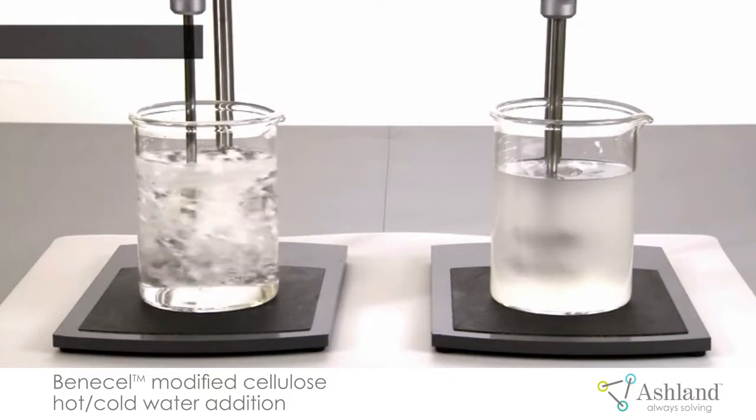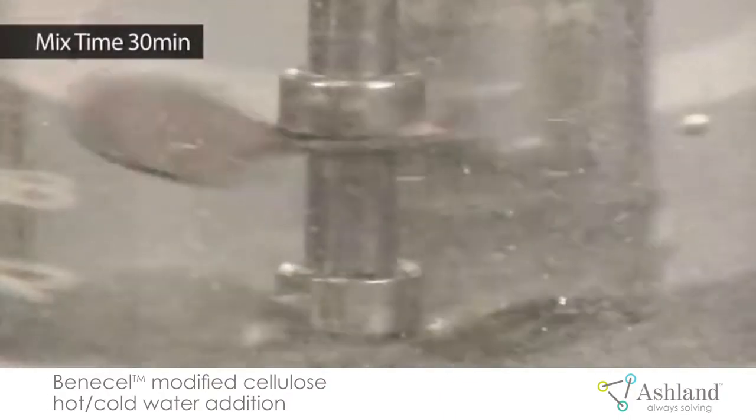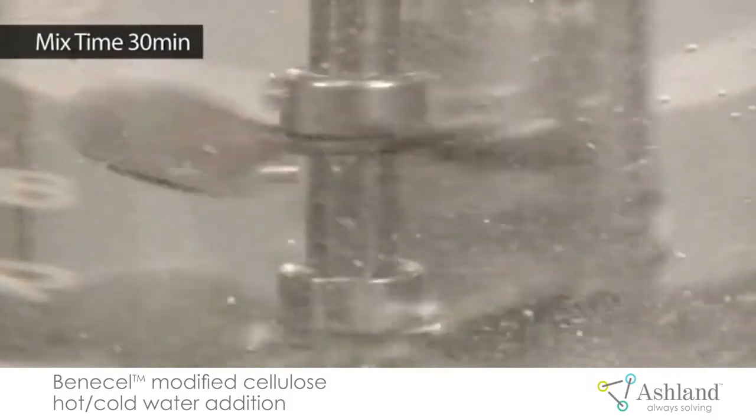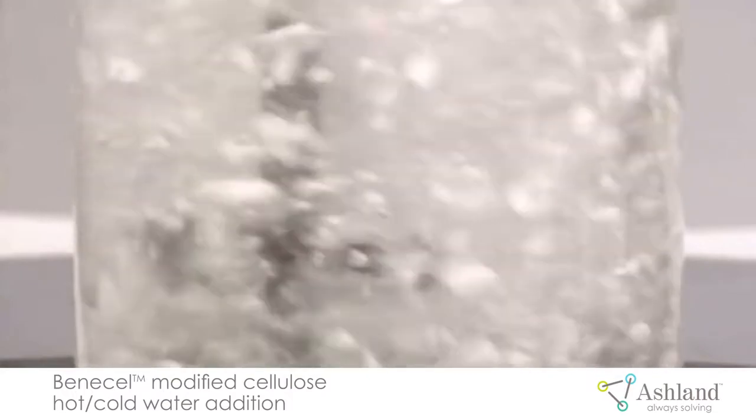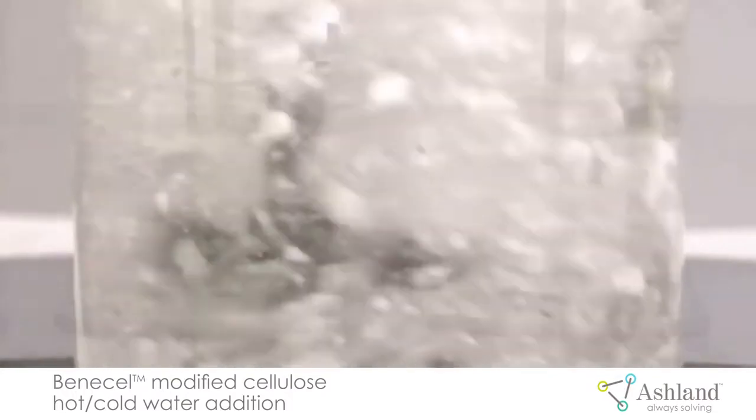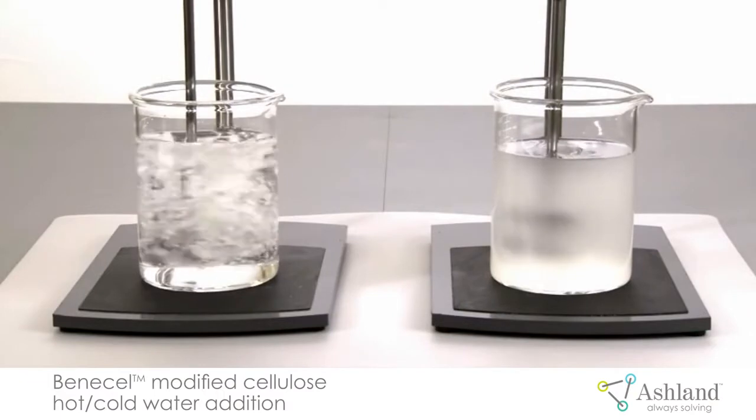We stirred the ambient temperature solution alongside the hot-cold solution of Benecel modified cellulose for about a half an hour. You can see that the hot-cold method was a much easier dispersion method. After half an hour, the solution on the right has cooled enough to allow the Benecel modified cellulose to hydrate.